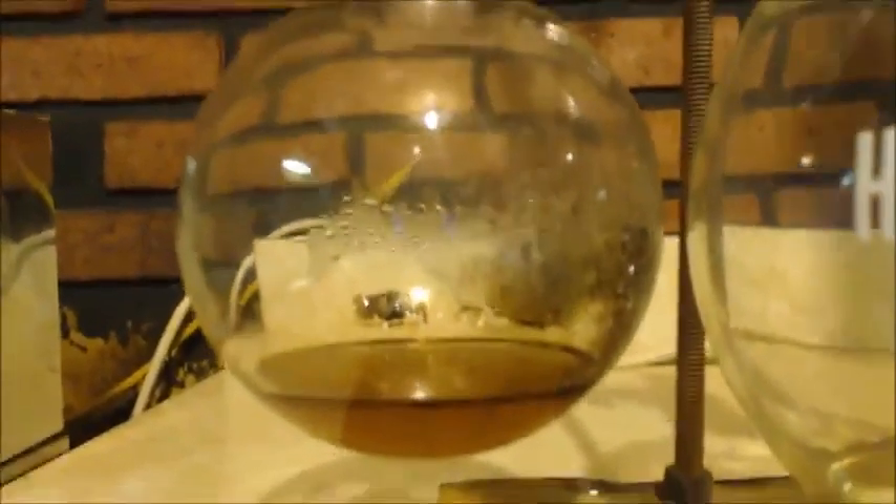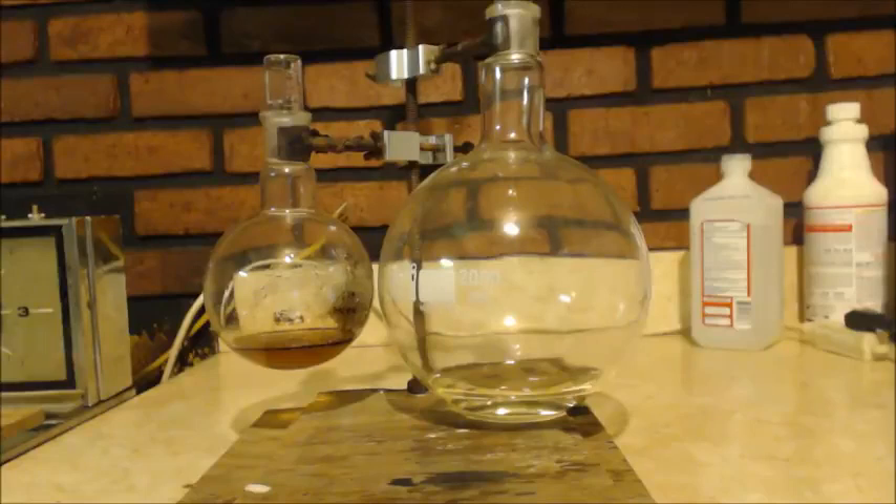Alright, here's the deal. This is the pot. But this is what I've got — the low boiling point stuff. She's never smelled chemicals. And it smells like an aldehyde.